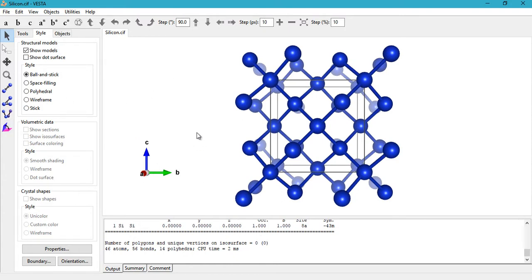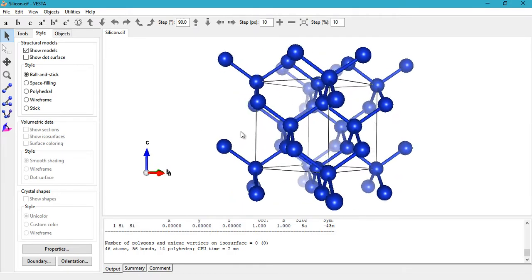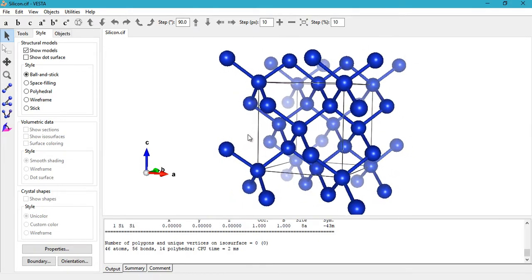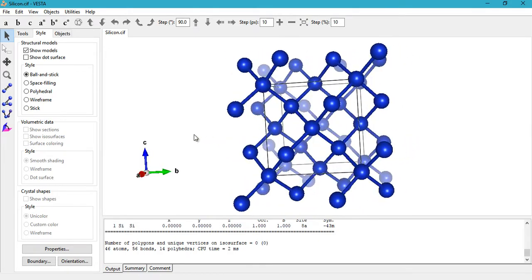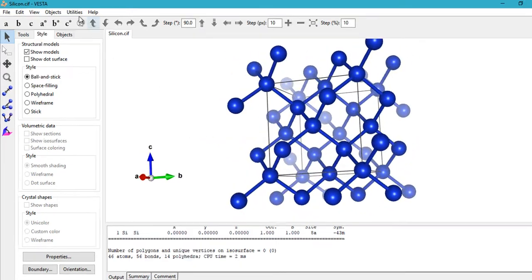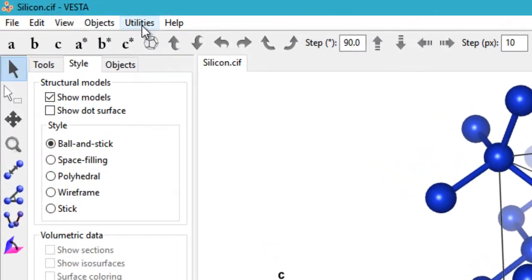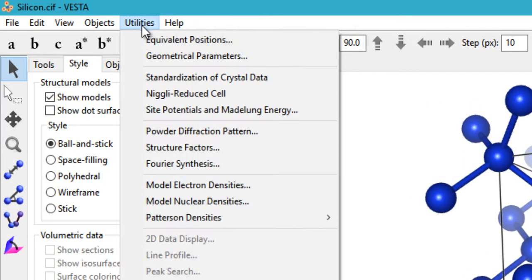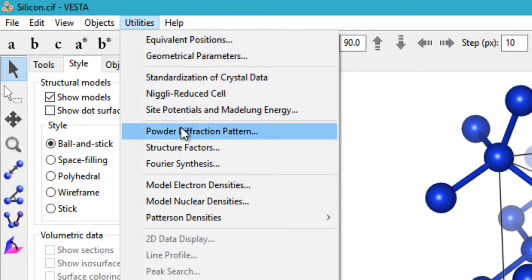So in this tutorial, I'm going to show you how to simulate an XRD pattern, or rather a powder XRD pattern, for your given crystal system. To do that, you need to click on Utilities and then go to Powder Diffraction Pattern.